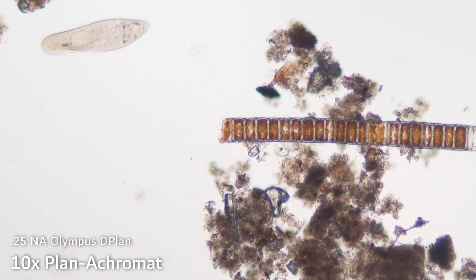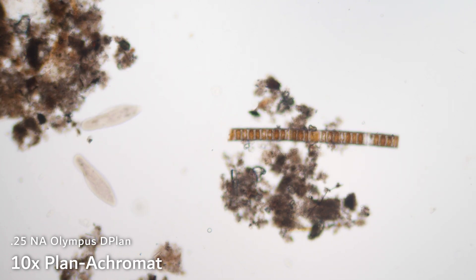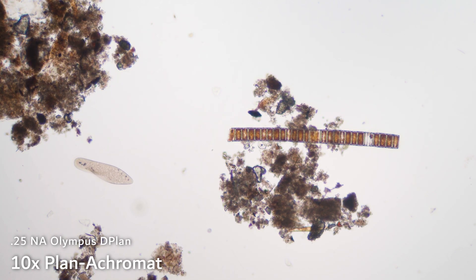It's up to you whether or not this is a deal breaker. I do find it kind of distracting. Sometimes when you're looking at stuff, the out-of-focus green can look like actual green stuff, and then you go to look at it and you realize, oh no, it's not green stuff. But generally speaking, it's definitely a huge upgrade for video quality and photo quality from achromats. And they're not too expensive — I want to say somewhere around $30, maybe $40 with shipping. So this is a pretty good objective, but we can do better.